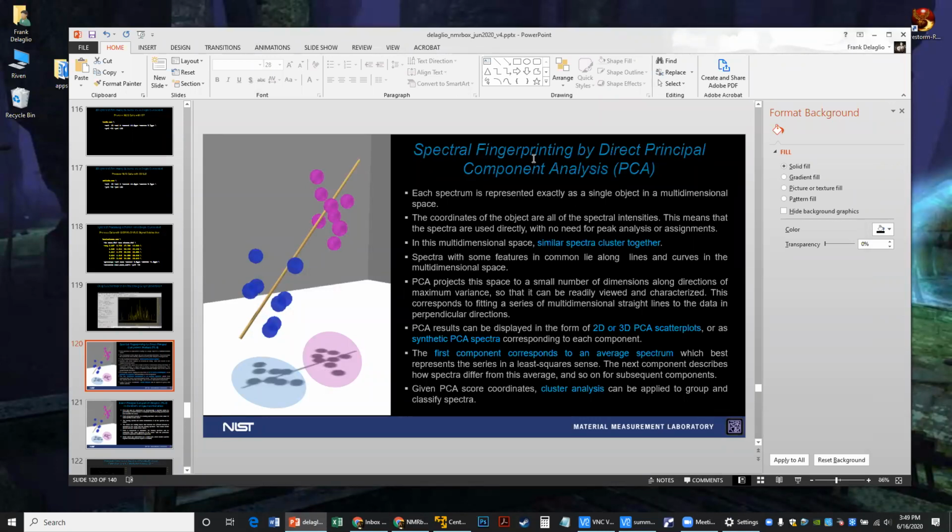Depending on the size of the final result, the 4D reconstruction could take hours. If you do it with NMRPipe's IST, which is the slowest of all the reconstruction methods, it could easily take a weekend. So you want to have all the reconstruction details settled before you sit down and do a complete reconstruction. And I'll show you how to do that and show you why it's profitable.